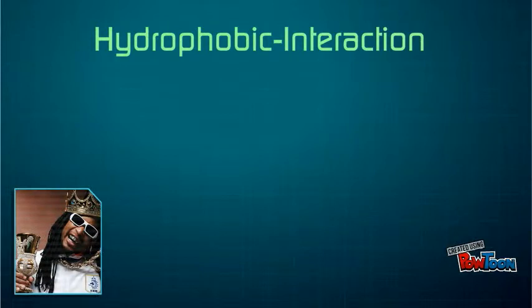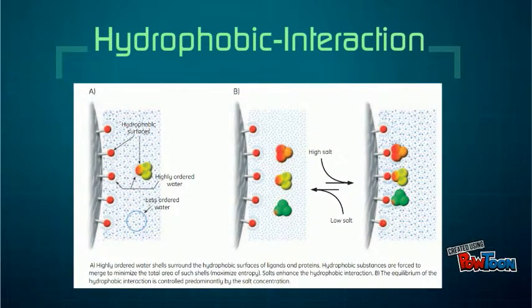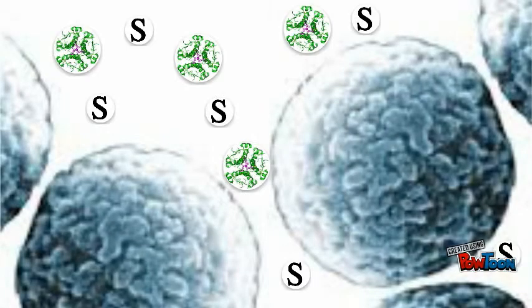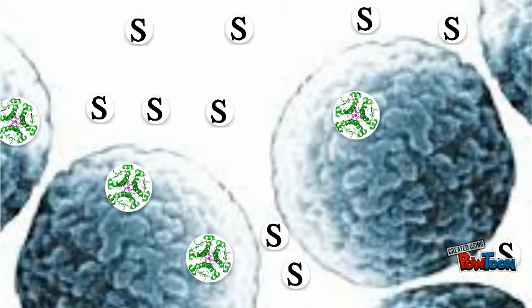Now we move on to hydrophobic interaction chromatography. This method of column chromatography is the newest method found, and it involves separating molecules based upon their hydrophobicity. Hydrophobic interaction chromatography works similar to how size exclusion and ion exchange chromatographies operate. The solution of proteins is mixed in with a high salt buffer that reduces the solvation of the molecules. As solvation goes down, the protein's hydrophobic regions become exposed, which are then absorbed by the media.